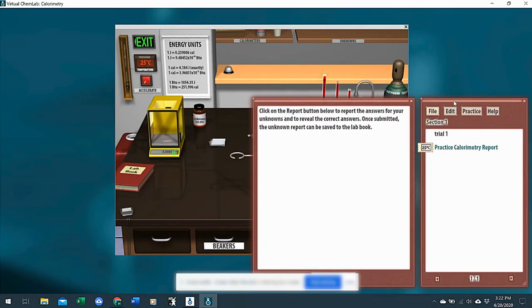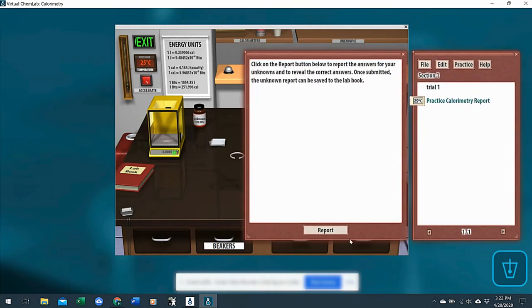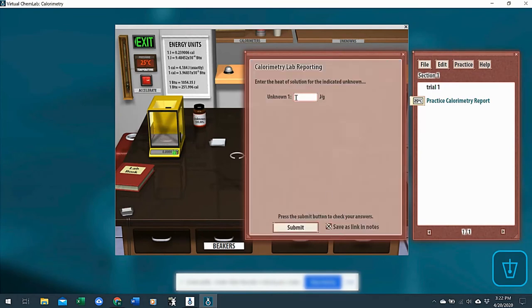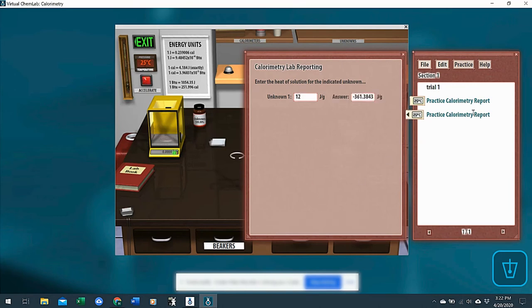Clicking on the lab book, like report, they would enter their calculated value here. So say they think it's 12, I'm just making up a value. Click submit. Once again, it reports the value to you and to them and what they thought it was.